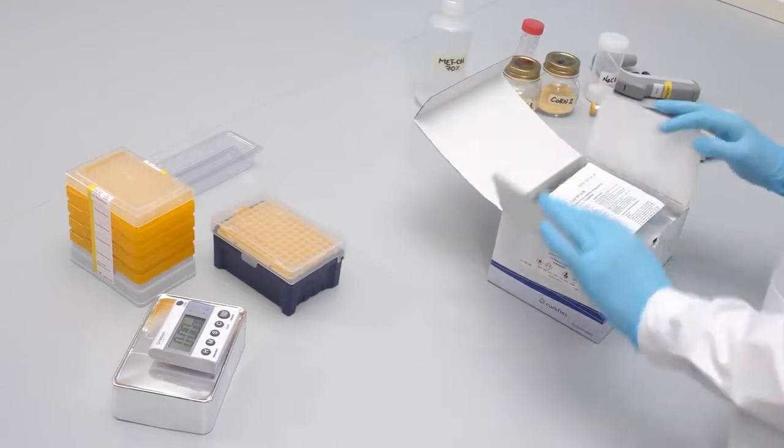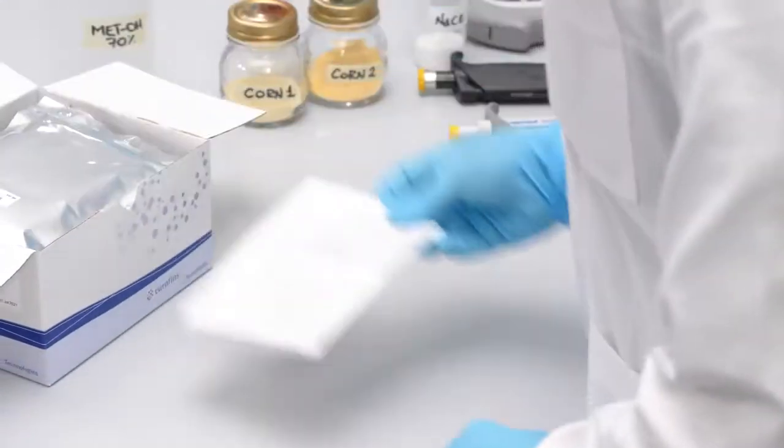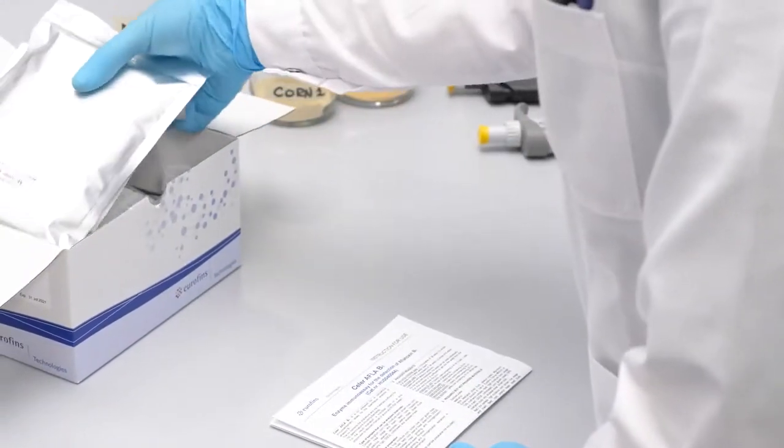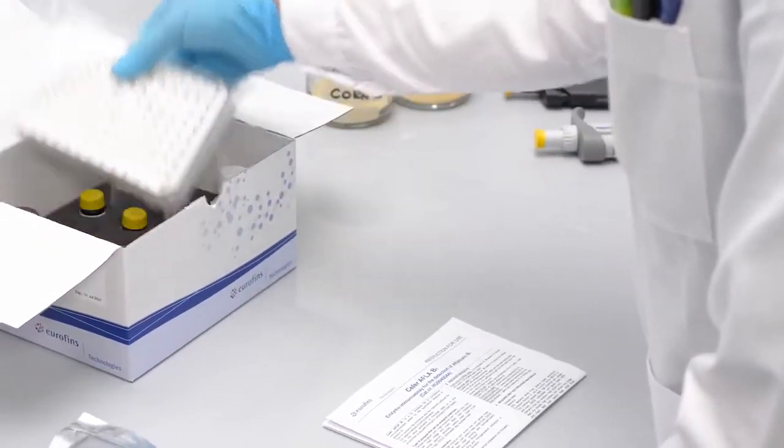Cellar Aflatoxin B1 is a fast, specific and sensitive ELISA test kit for the quantitative detection of Aflatoxin B1 in food and feed.